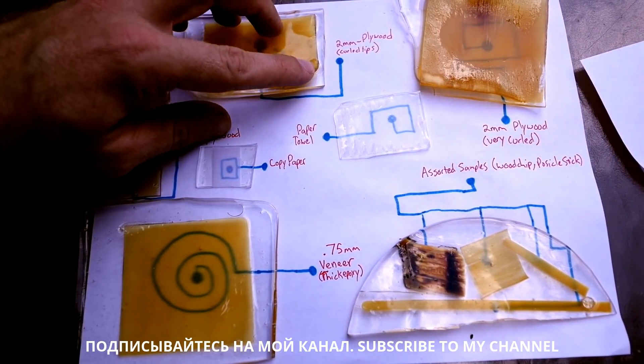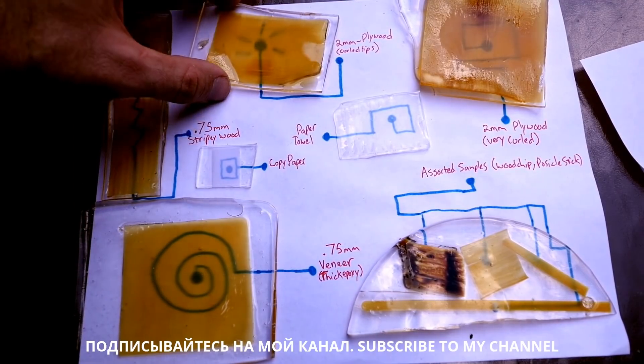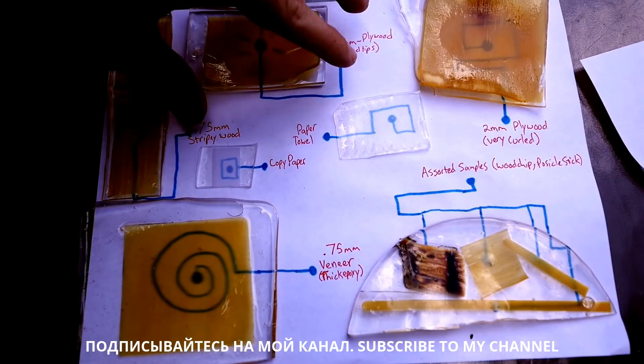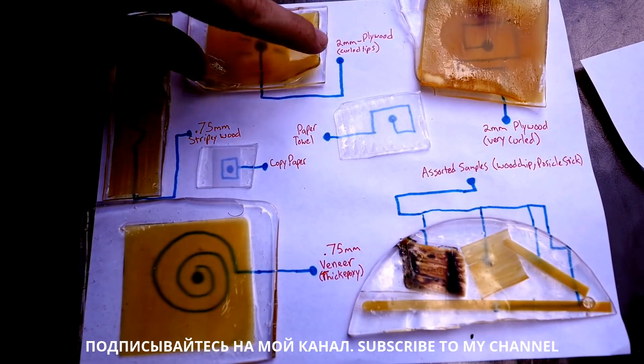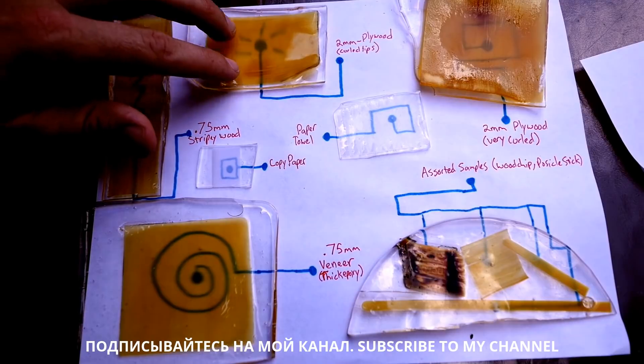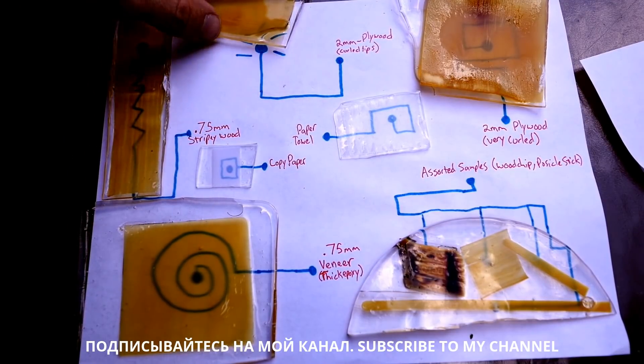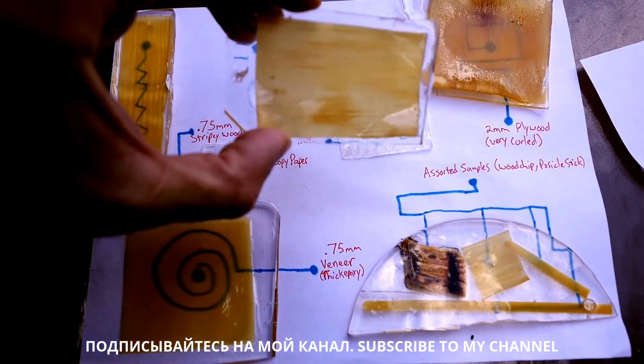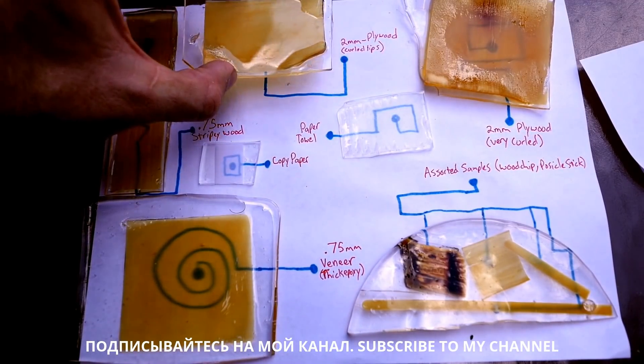Another problem I had was that I tried to do lots of samples at once, so some of the water evaporated from the bath and left some samples starting to curl up, which of course affects their transparency a good amount. But still, with a more improved process, we could totally get this going.